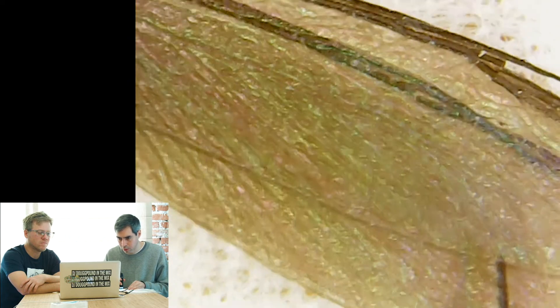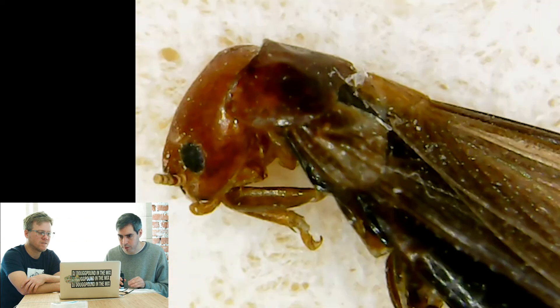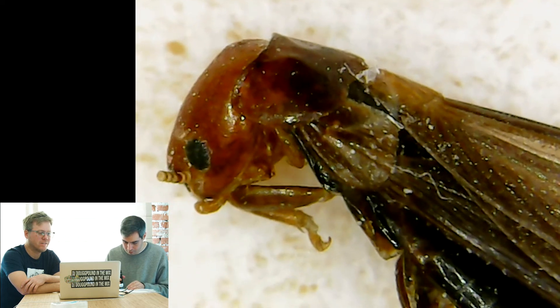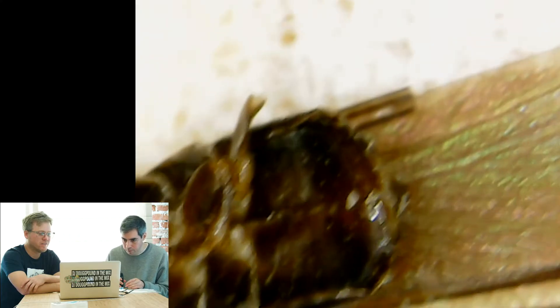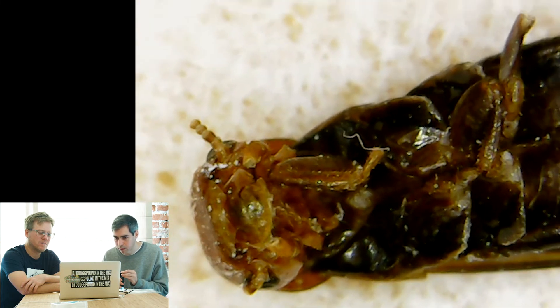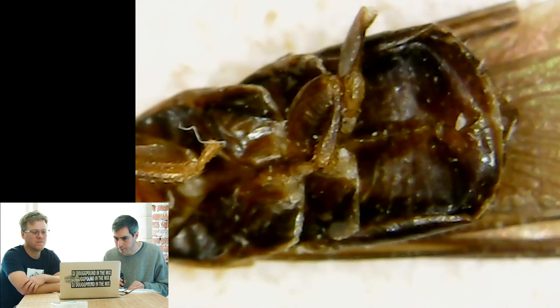This is some sort of termite, looks like. We'll get a shot of this so you can see it. I don't know what this is, but I think it's like a termite. So here's the wing. Wow. That's the head of it, obviously. It's another dead bug. Looks like the antenna and the legs aren't really there anymore. What'd you do with them? I ate them. So that's just a little something here.